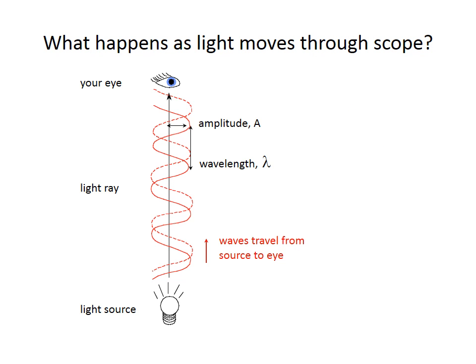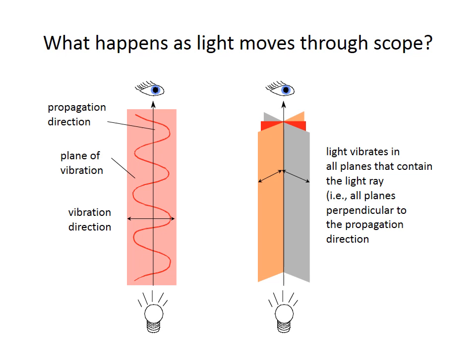When using a standard transmitted light microscope, white light of many wavelengths and orientations travels up towards your eye. The light propagates towards your eye, but vibrates in all possible directions. But in a polarizing microscope, a polarizing filter is mounted over the light source, which blocks all but one orientation for vibrating light. Typically, the filter permits light vibrating in the east-west direction to be transmitted as you look down at the field of view.